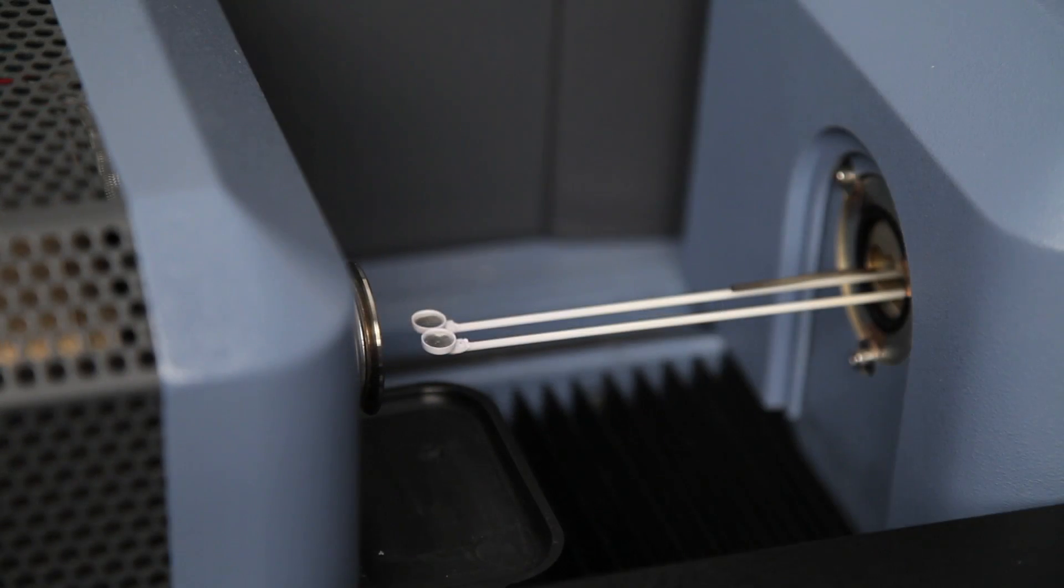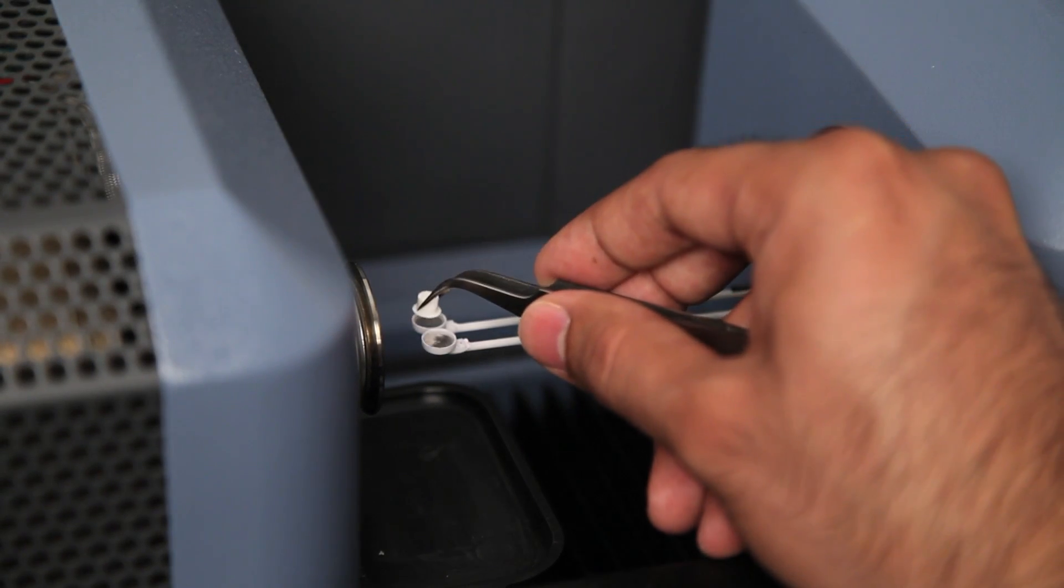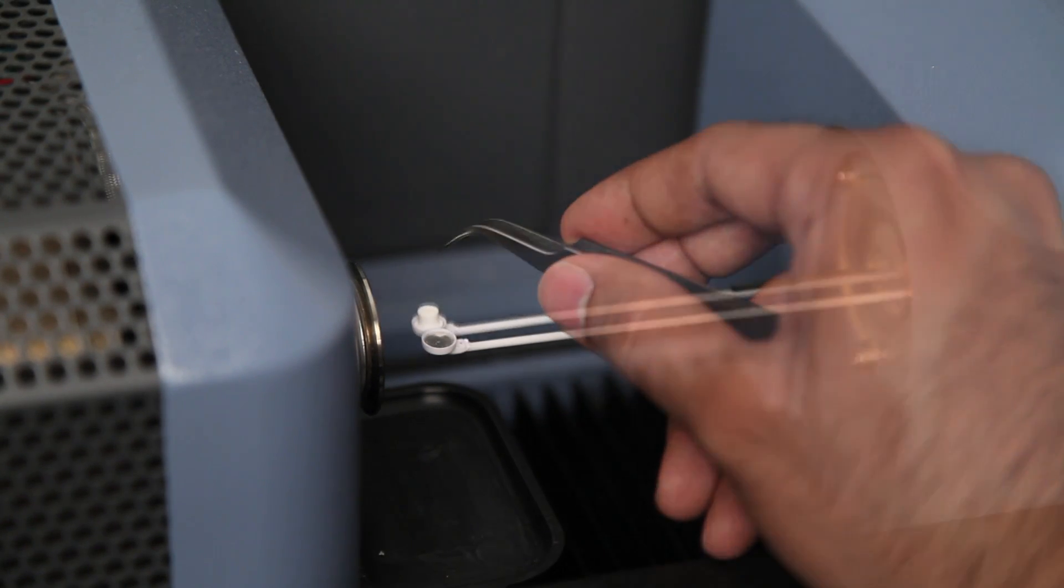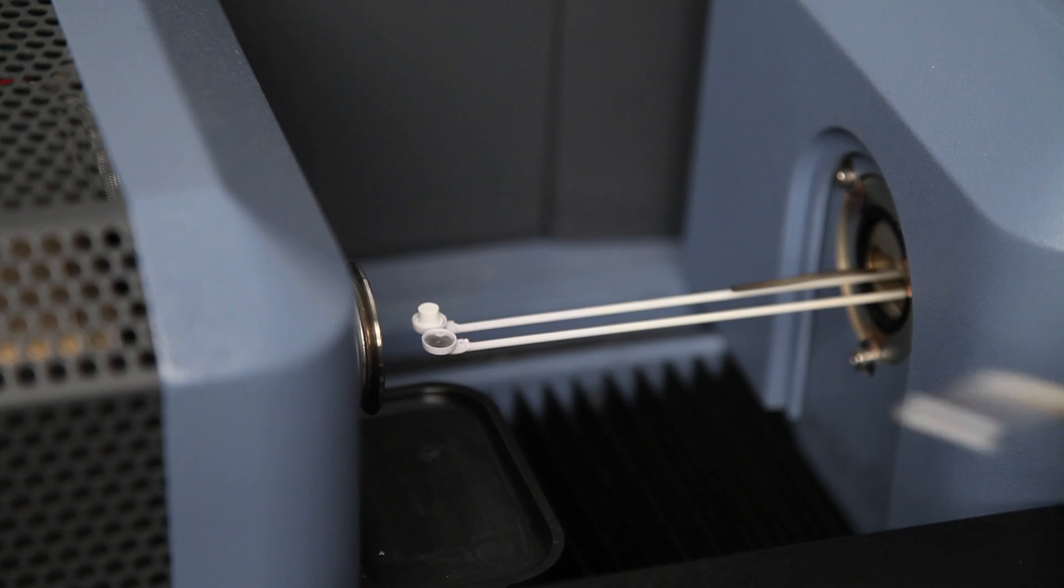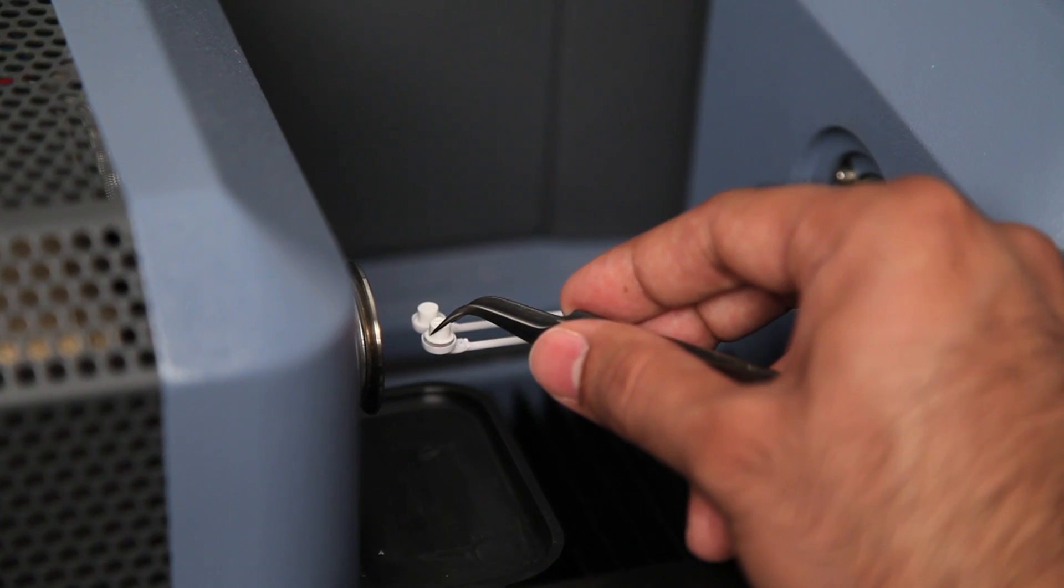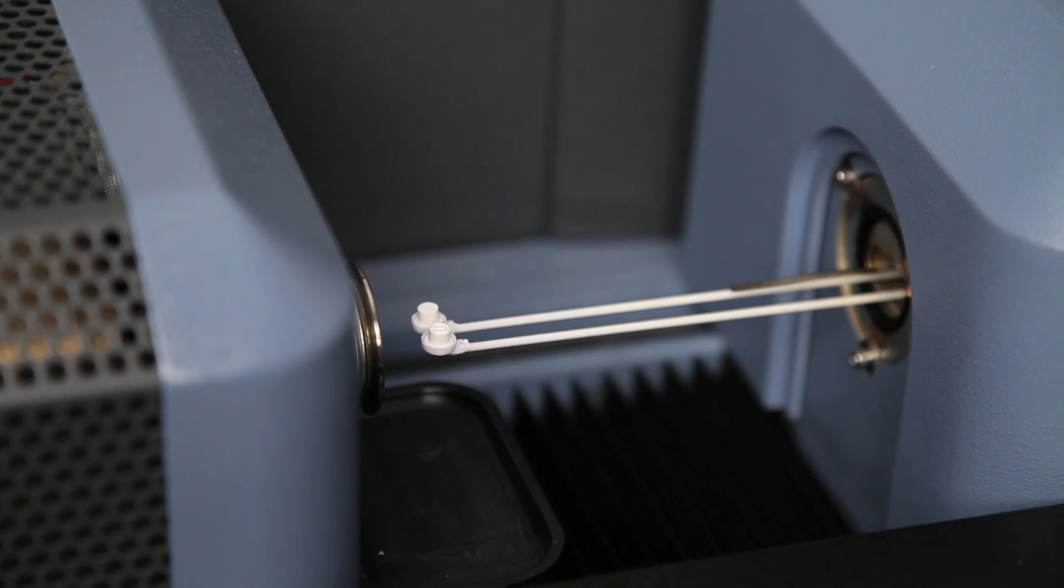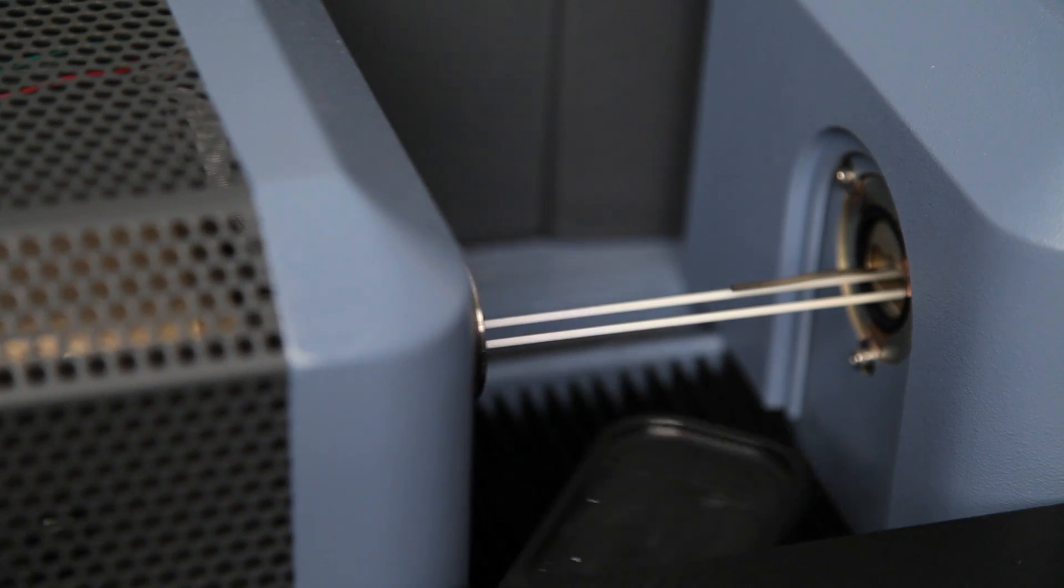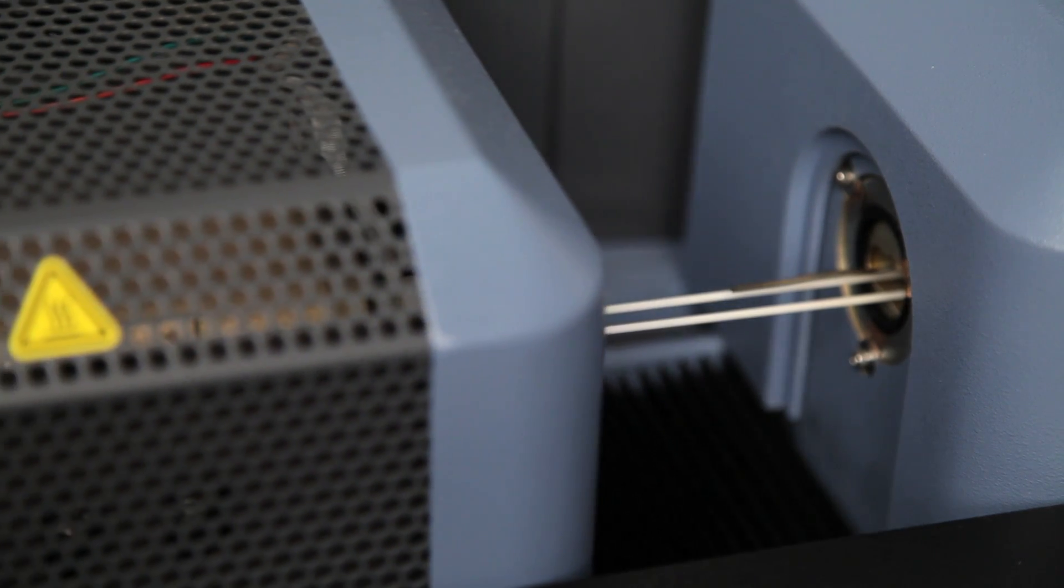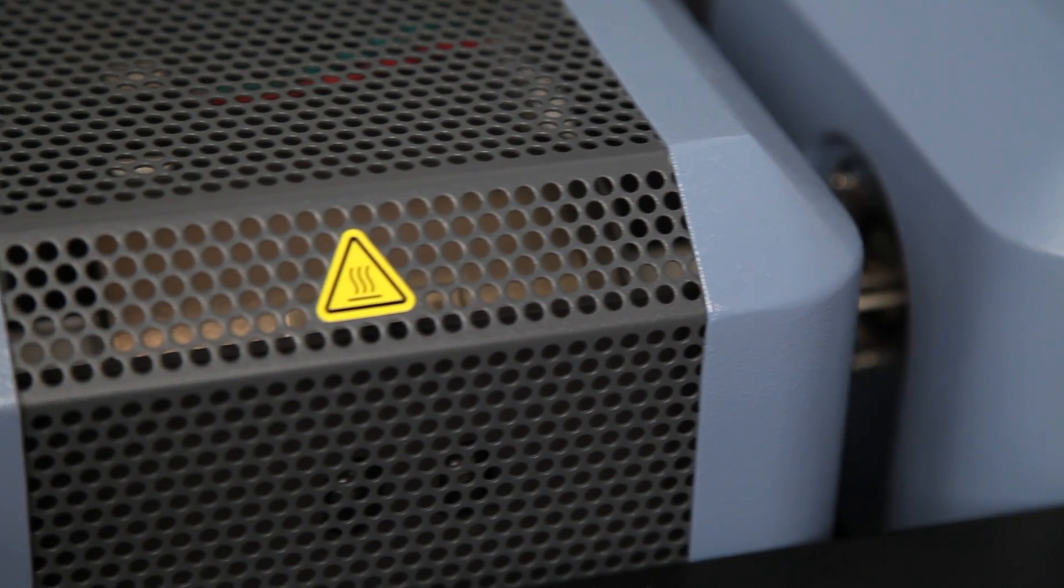The second calibration experiment is identical to the empty beam runs, except that it is run with the weights. The weight marked with an S should be placed on the front platform. Place the weights as close as possible to the beams.